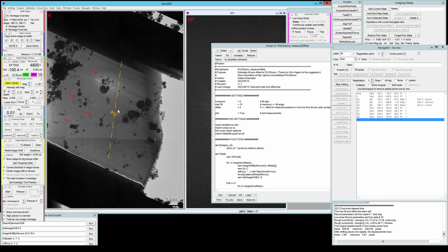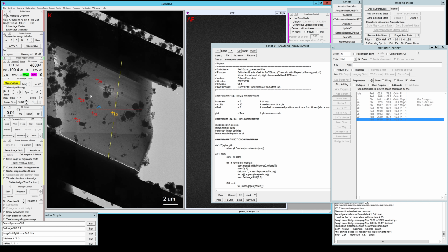And also, this is just a preliminary selection. So during the select targets procedure, you can still say, oh no, this one wasn't as interesting as I thought, so I'm going to skip this one. And of course, I just picked 5 targets here now. You can pick 20, 30, however many you wish to collect.